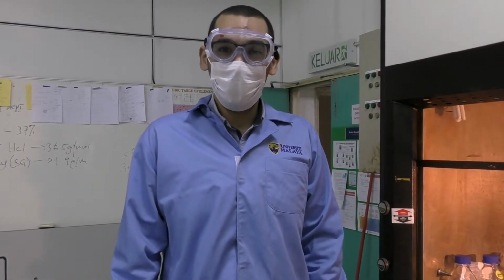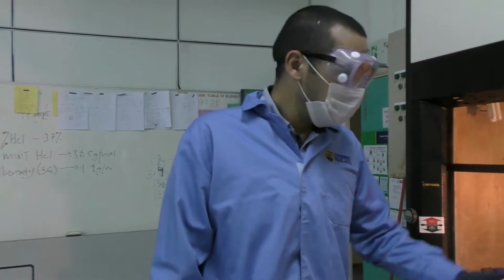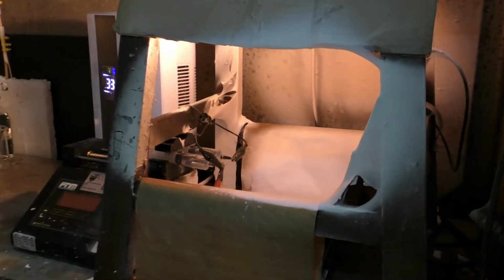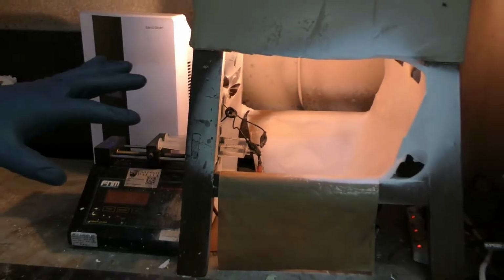Sulaiman Sari, PhD student, Chemical Engineering Department. My work is to fabricate a nanofiber material from a photocatalyst material for splitting water and evolving hydrogen under a simulated solar system. This is the first part of the fabrication.